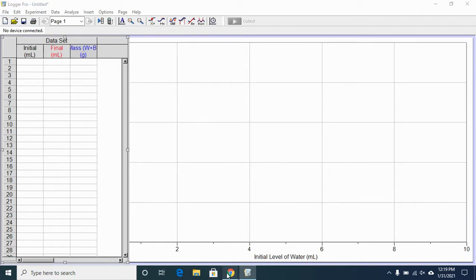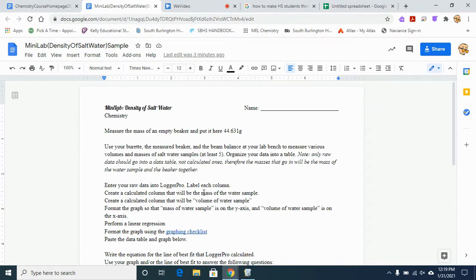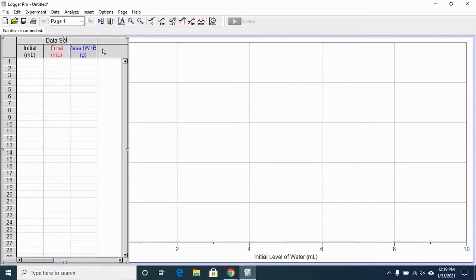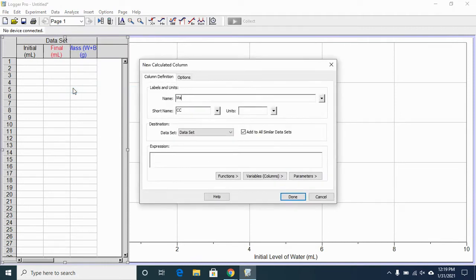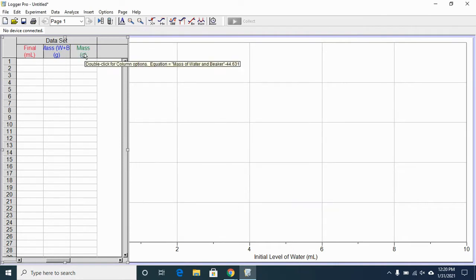Next, it says to create a calculated column that will be mass of water sample. Another that will be volume of water sample. That is under data, new calculated column. Expression is where you're going to type in the thing that you want it to calculate. The variables are telling you which of these columns here it will be using to calculate. And so you would pick the variable. So for a mass of water sample, it's going to be the mass of water and beaker. You don't want to try to type this because it needs to be exact. So you would select it from columns. Now I'm going to subtract from it the empty beaker, which I typed in earlier was 44.631 grams. And that is here. I'm going to double check that that will work by putting in my first mass.